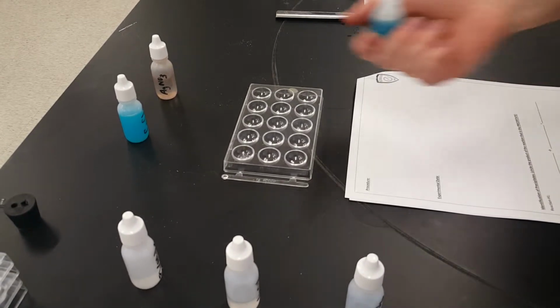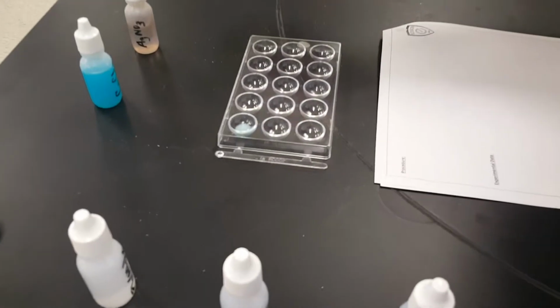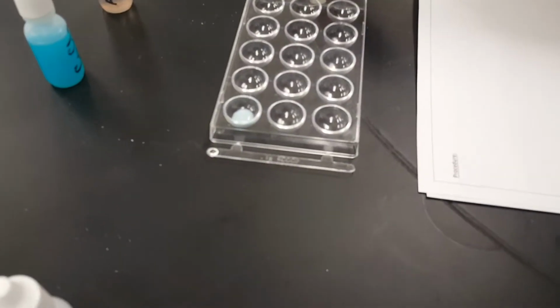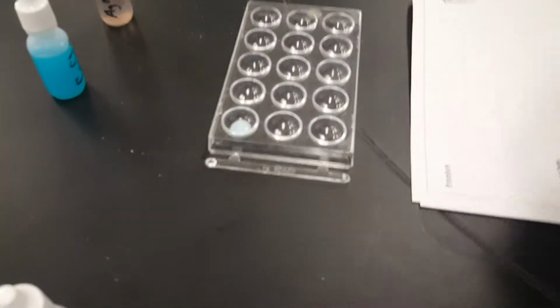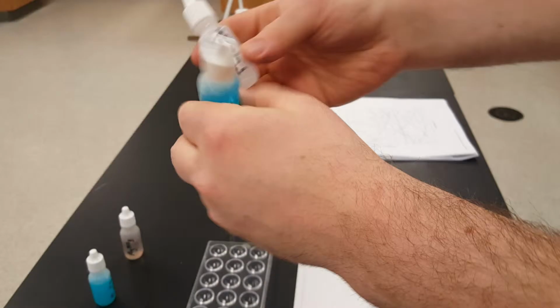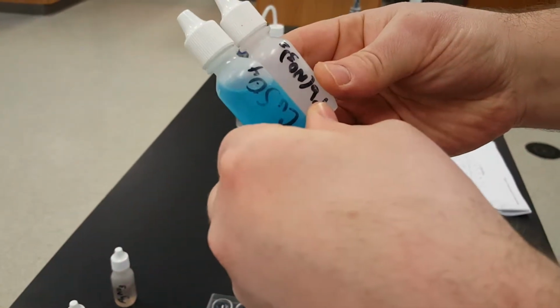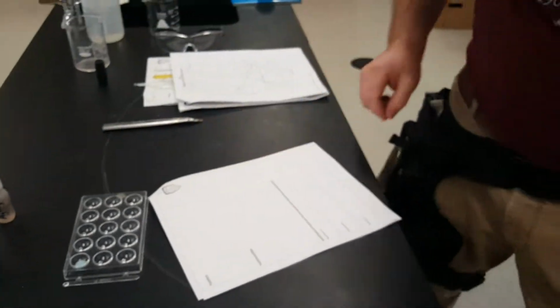Did no reaction happen, or did a precipitate form? 1, 2. See that? How it became white and cloudy real quick? That means a precipitate formed. So in my data chart, I would record lead nitrate versus copper sulfate, a precipitate formed. Let me show you how that works on the big chart up here.